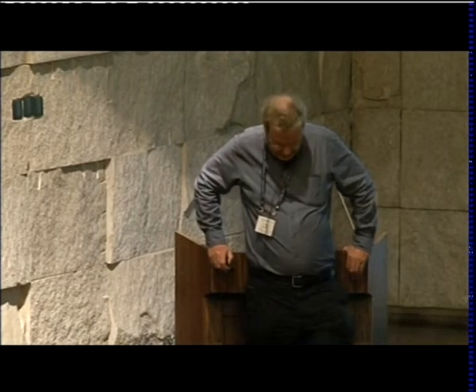Yeah. Dan, with the new detectors, what do you anticipate as the practical limit of resolution? Would you be able to reach a TRP channel-like resolution, or do you think there's just too much inherent heterogeneity in these probes? Single particle analysis or in cellular tomography?